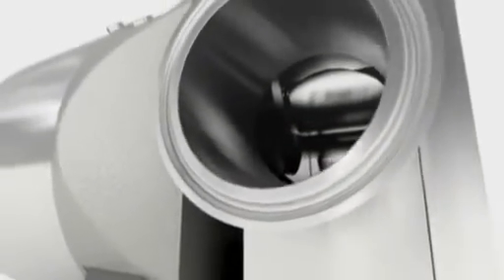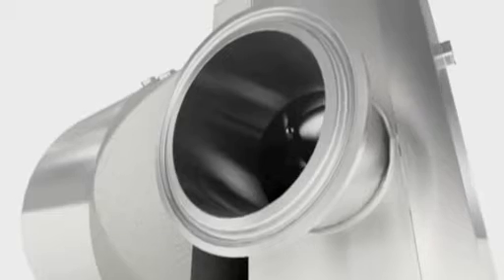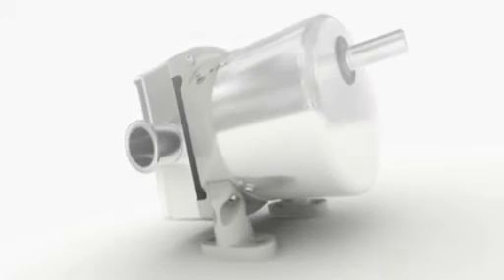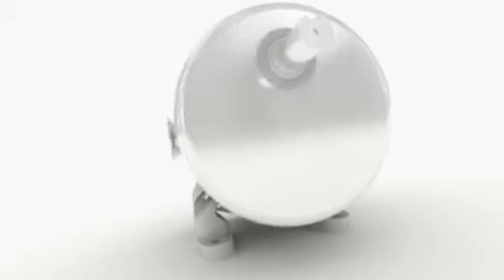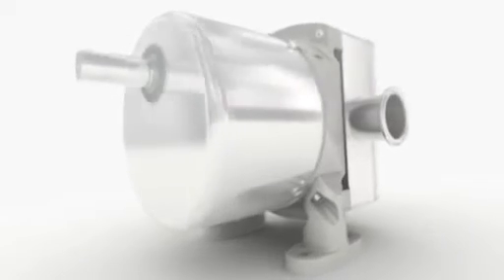but it also reduces the risk of bacterial growth during shutdown. With a paint-free and rounded, easily cleaned exterior, the Optilobe promises long corrosion-free life and a clean plant environment.